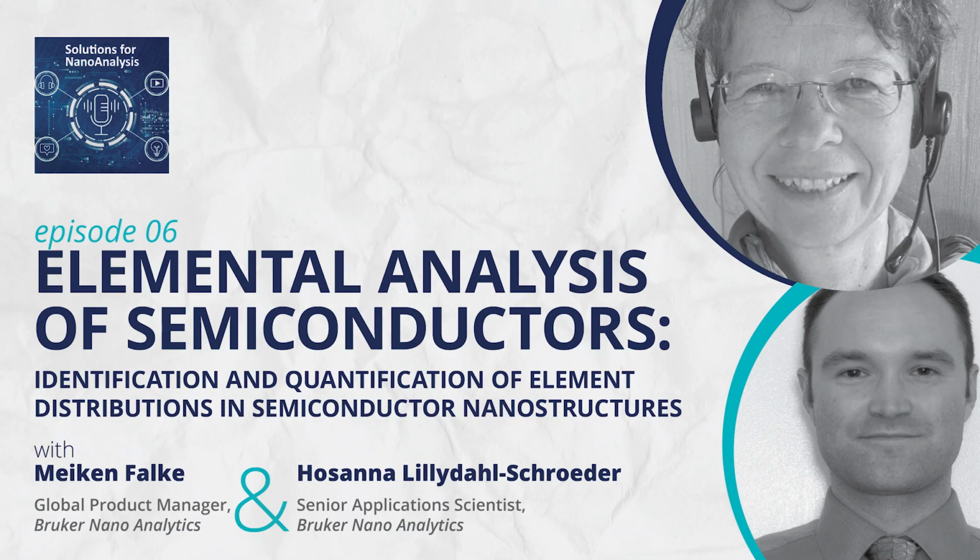So we need to be on the atomic scale that is done in TEM. But of course, on the nanometer scale or atomic scale, we only see a very small piece of our specimen, and therefore SEM or larger scale investigation is also very important. And I know that SEM is used a lot, specific SEMs or specifically designed SEMs with specific additions of analysis are used also to evaluate whole wafers or wafer surfaces for contamination or functionality.